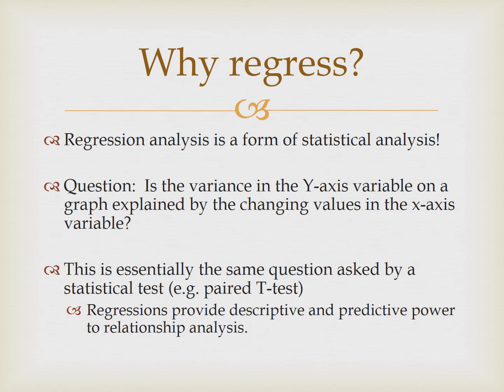In this week's lab, we asked a question. If we change the surface area to volume ratio of an agar block, does that really relate in any way to the change in the rate of diffusion that we might see? Does X influence Y?